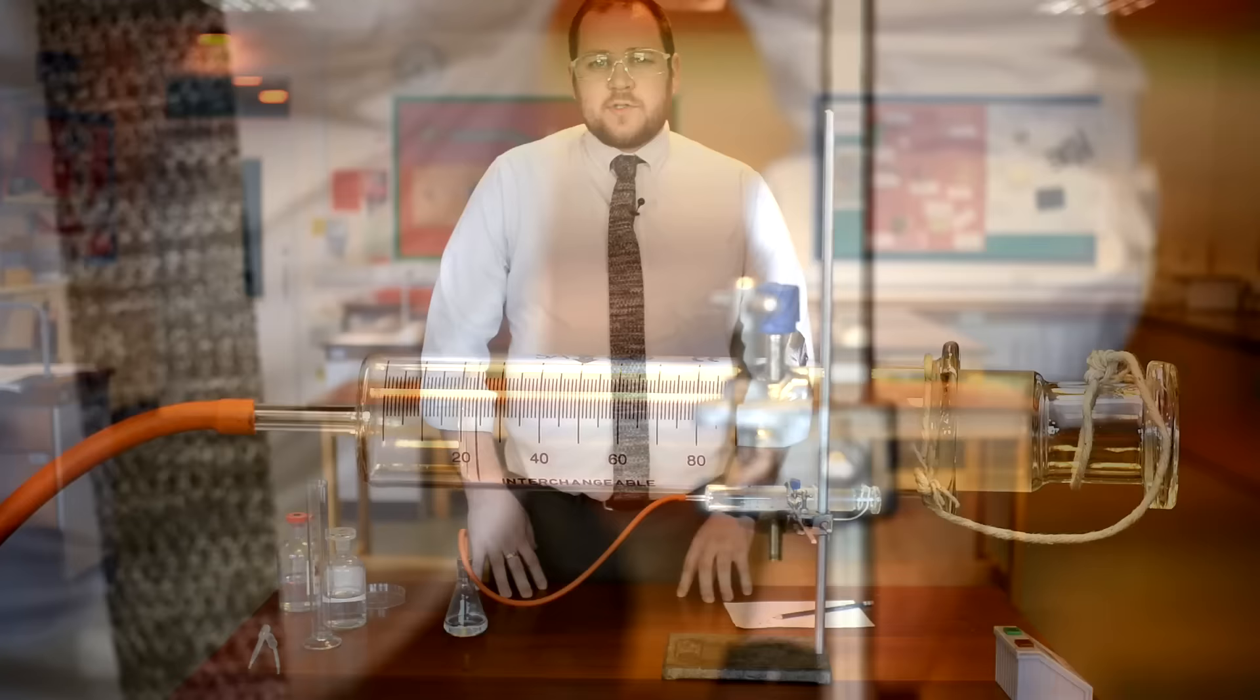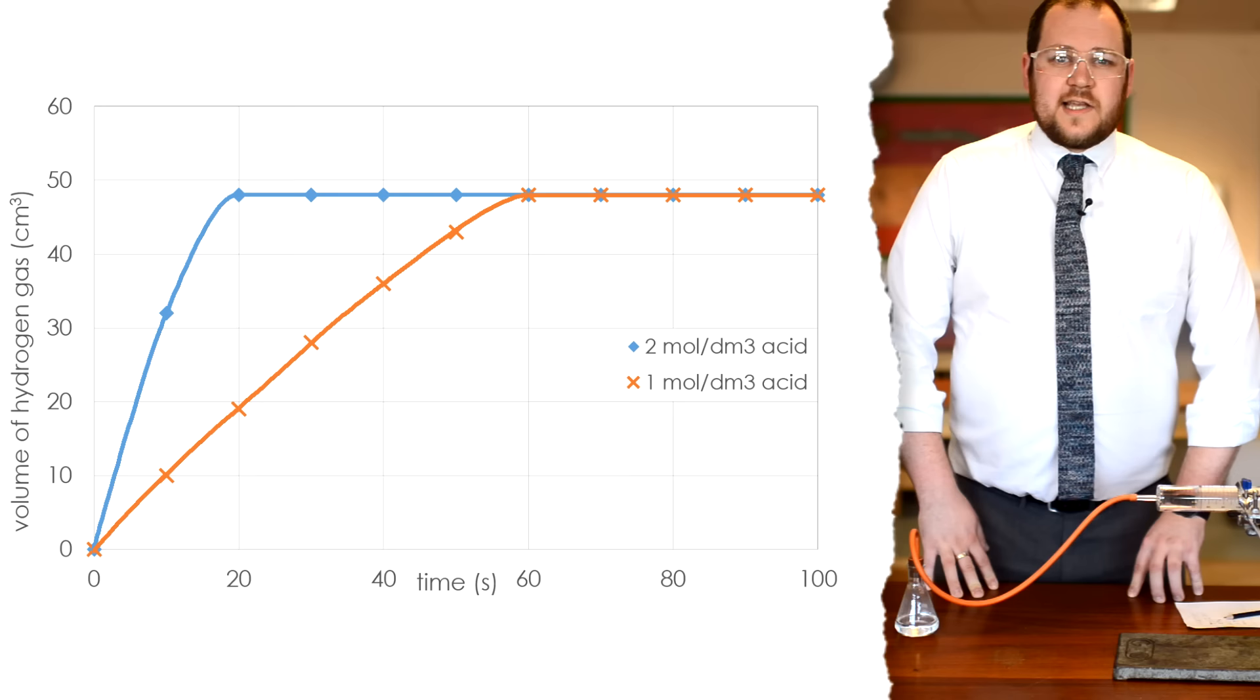Now you've collected results of different concentrations, you're going to draw a graph of your results. On your graph you'll have time along the x-axis in seconds and volume of gas collected every 10 seconds in centimetres cubed on the y-axis.